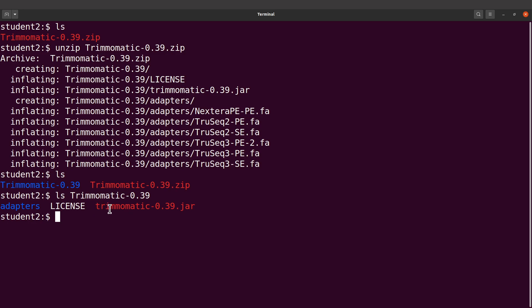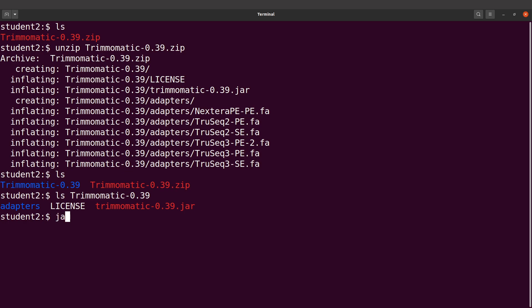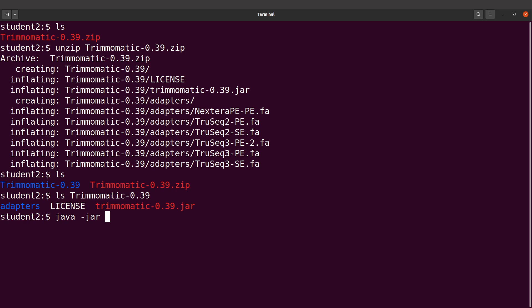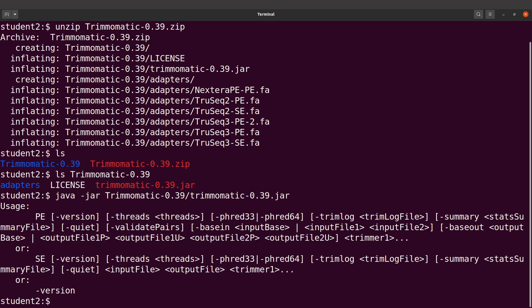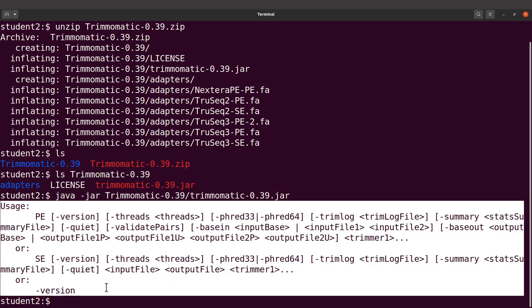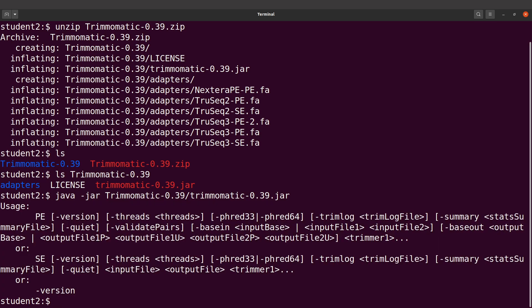Now we have the JAR file, so what we can do is test Trimmomatic. To do that we have to call Java and also specify the JAR file. We can say java -jar and then specify the JAR file path — the JAR file can be found in the directory. Let's execute this command. Once we do that you'll see this display, and this means that Trimmomatic is working fine.